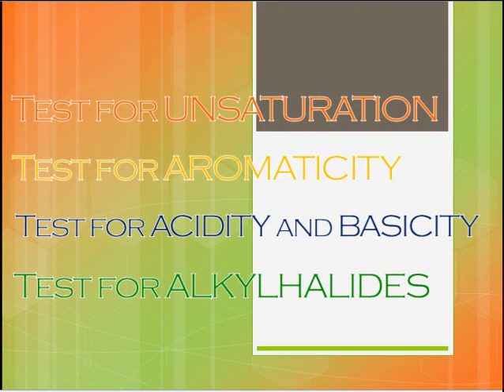Well, we're done with the tests for aromaticity. Now let's proceed to the test for acidity and basicity.